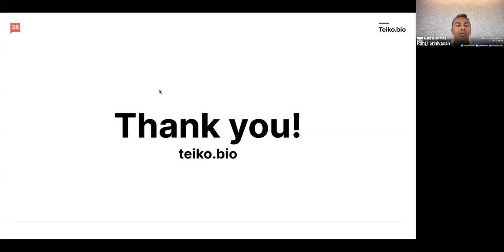Okay, so first question is, what kind of data do you have for whole blood? So we don't have data on whole blood yet for this particular assay. We've done this on peripheral blood mononuclear cells, but that's ultimately in our game plan. And we have also introduced a Toku kit, which makes whole blood collection easy. That's available on Teiko.bio. But yes, that's a great question. This data set is only on PBMCs for today, but eventually we plan to do this similar analysis on whole blood.